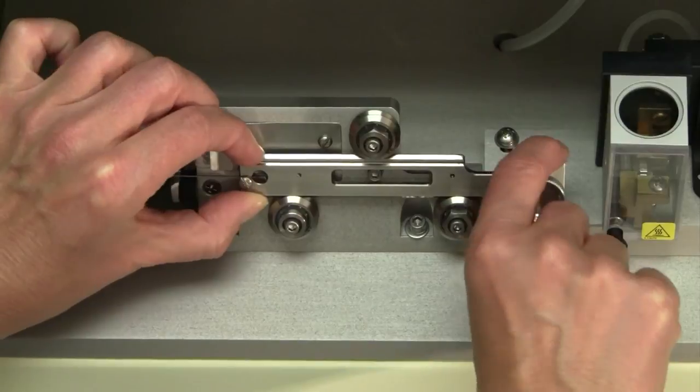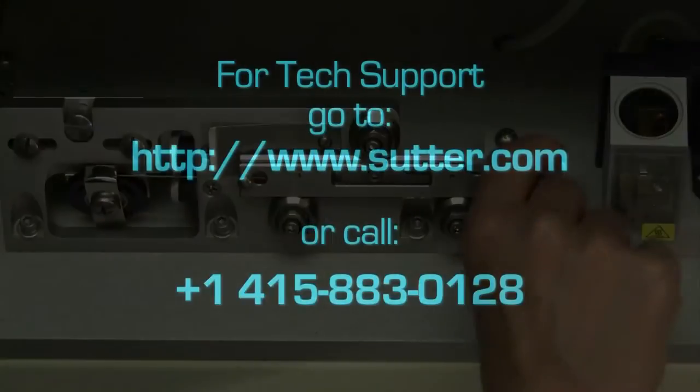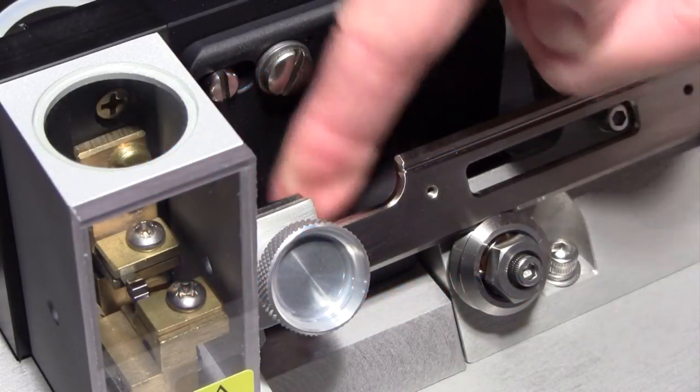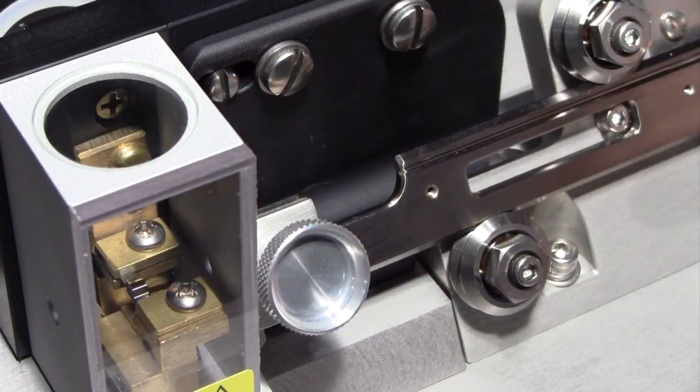Therefore, do not try to adjust the vertical play of the puller bar unless instructed by Sutter Tech Support. In addition, do not apply a lot of horizontal force to the puller bars to avoid bending them.